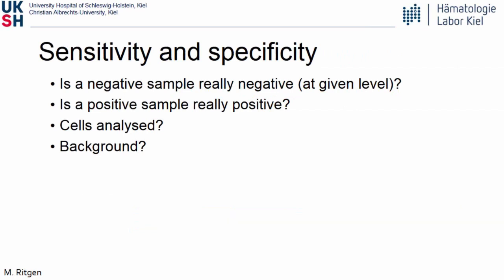And if you develop a flow assay, I think it's important to know about the sensitivity and the specificity of this assay, and this was done in the Euroflow group, I think, quite extensively, at least published in recent years for the diagnostic samples, and it will be soon for the MRD as well. And so there's the question, what is positive and what is negative, and the false positive and false negative rates, and how many cells are analyzed is a big issue in this aspect, and the background. And this is what I want to go into in detail in the next few slides.